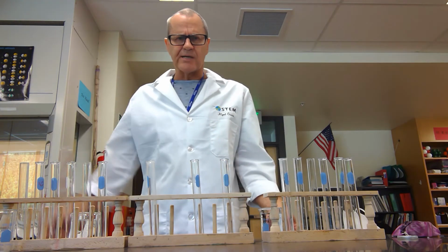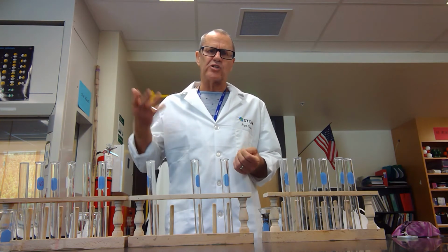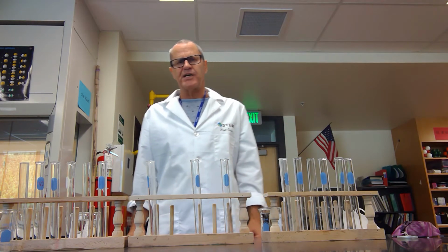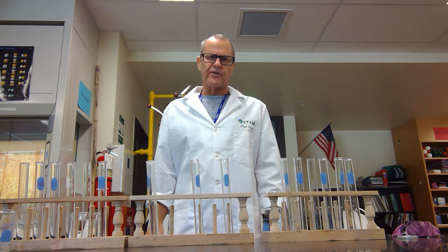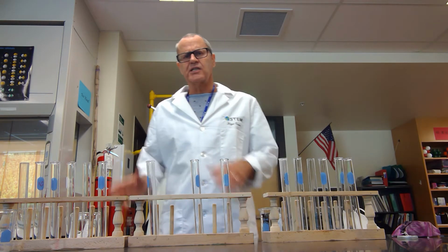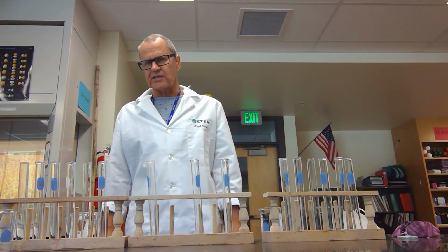Now, there's more than one substance that changes colour, so we're going to get more than two different colours. You're used to litmus, maybe, that turns red or pink in an acid and blue or purplish in a base. And at neutral, around about the pH of 7, it sort of wavers about and doesn't know what it's doing. What we've got here is quite a number of indicator compounds which change colour, structure and therefore colour at different pHs, and so this whole thing gives a decent sort of range of pH colours.